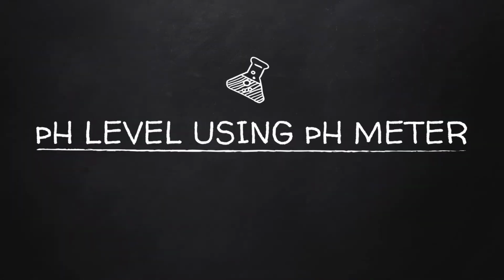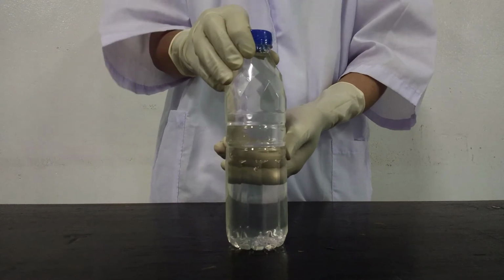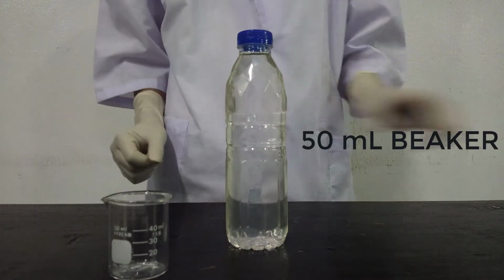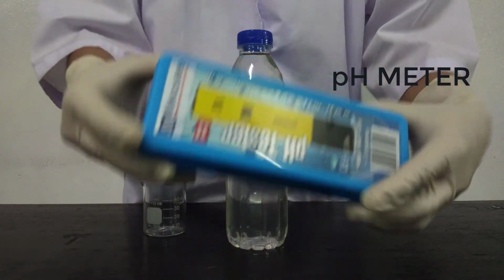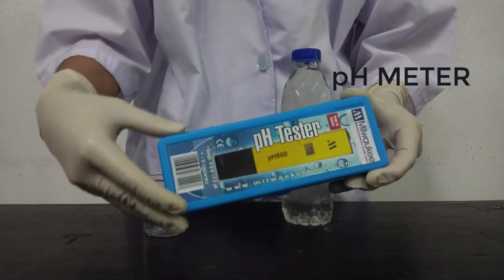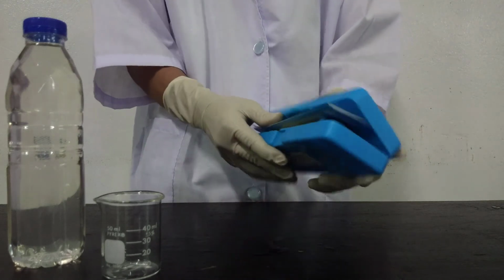Now let's move to finding the pH level of water samples using the pH meter. For this experiment, we will need the following materials. Of course, the water sample. We also need a 50 ml beaker and our pH meter or pH tester. Let us check the contents of our pH meter.